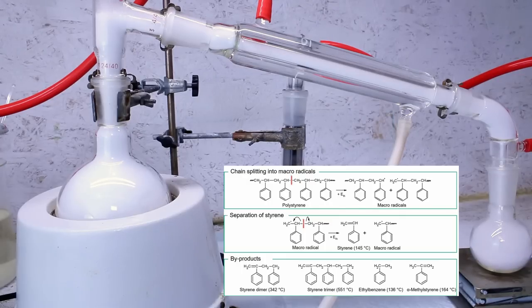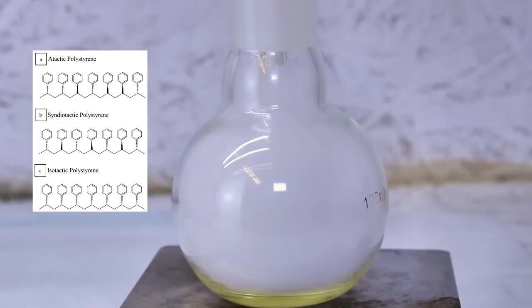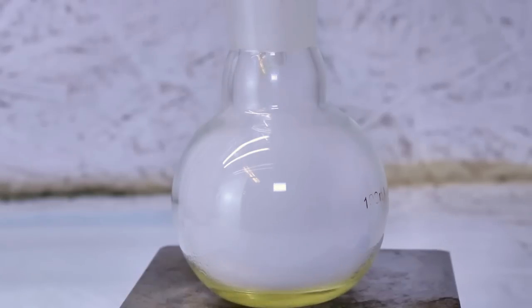This is because polystyrene is essentially just a really long chain of styrene molecules, and when polystyrene is heated sufficiently, these bonds holding the styrene molecules together will break and reduce styrene back to its liquid form.